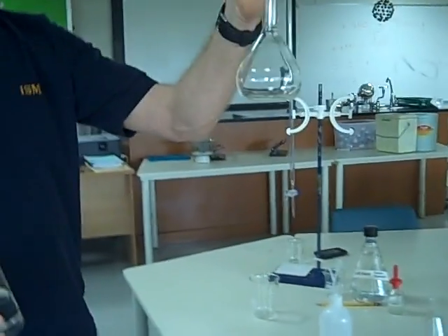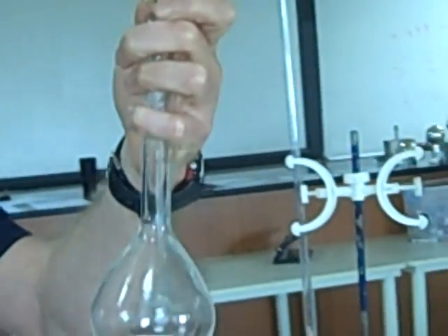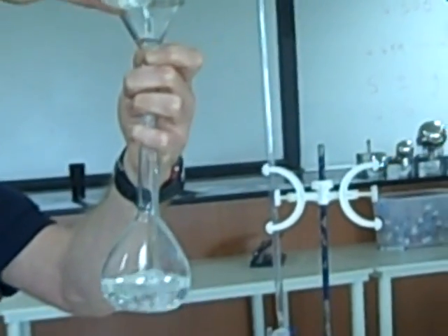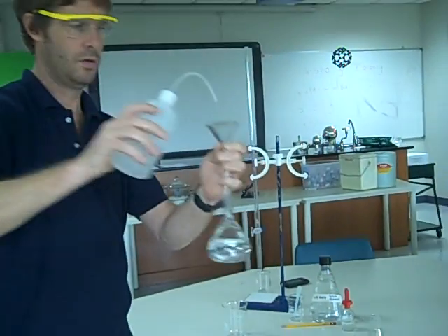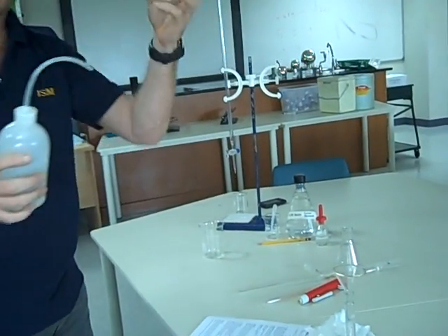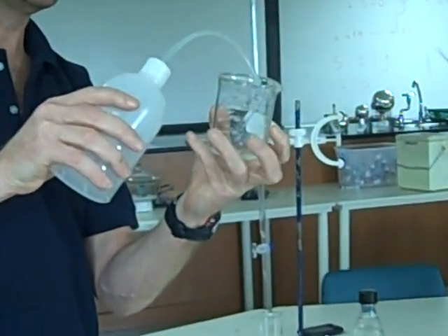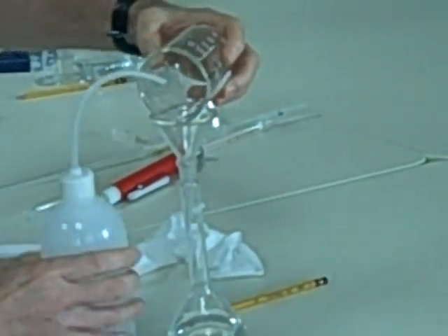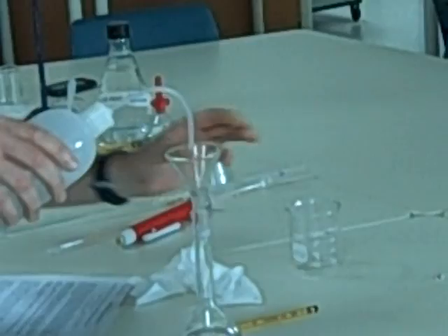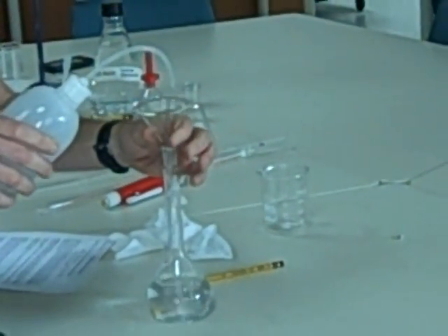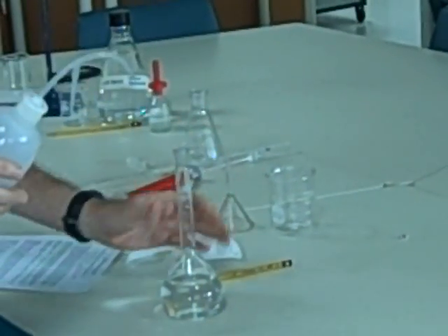Then, hold the funnel up. Don't let it sit down, otherwise you end up spilling. Hold it up a little bit, and then pour your solution into here, like so. And again, we are going to rinse. Remember, now there's some oxalic acid solution in here. So we have to wash our solution into here. We've got everything out of there. Just rinse that a little bit. And now we're going to make up.